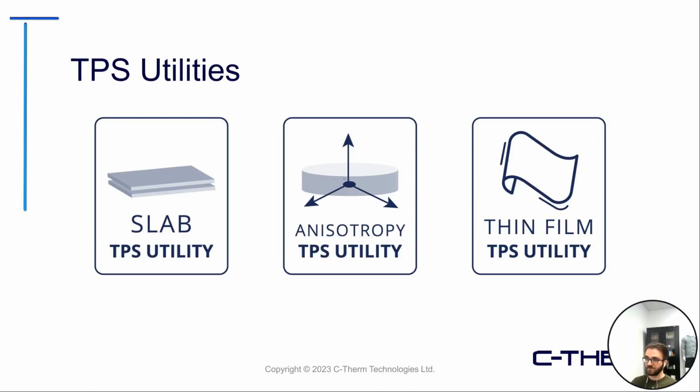Now, again, the reason why the TPS is of great interest in many groups is towards some of these more advanced utilities. And for us here today, the one that I'm primarily focused on is the thin films. This is, of course, the topic of our discussion here today. So I'll give a little background on how this method works and some example data that you can collect.